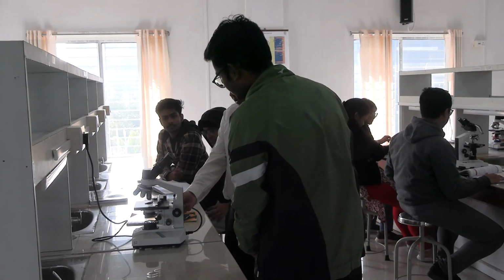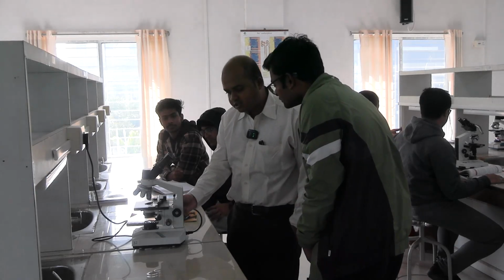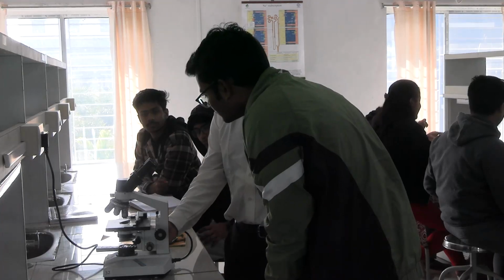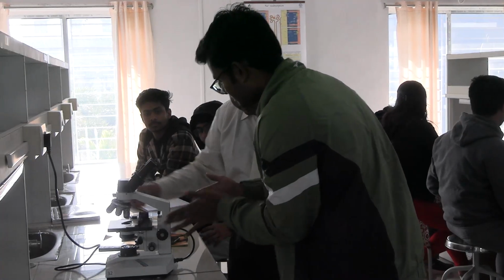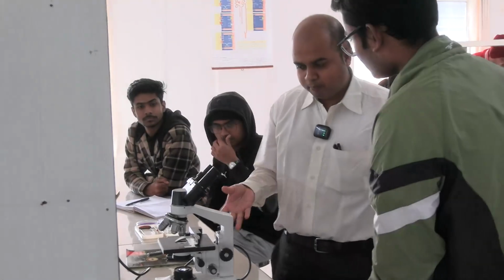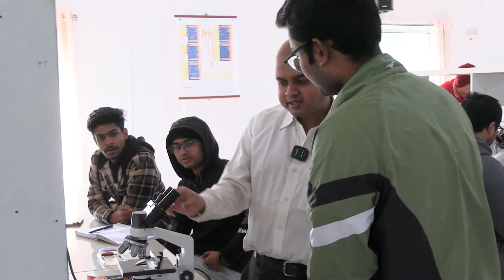I'll just tell you, focusing is simple, but not that simple. This is the coarse adjustment screw for bringing the platform up and down. This is the fine adjustment screw. After something is focused, it will give you fine tuning, just to make it a bit clearer. These are the eyepiece lenses which can be detached.